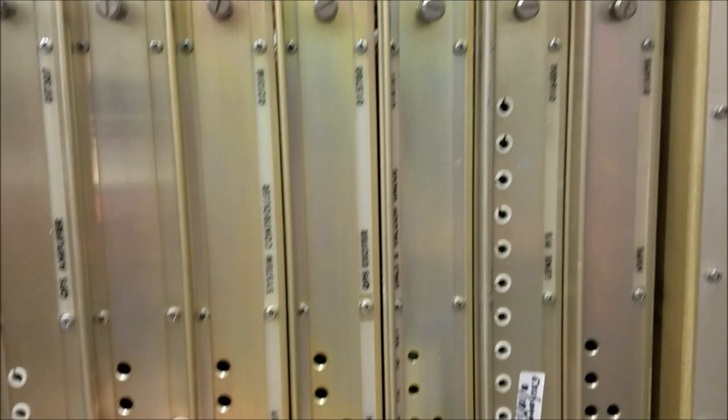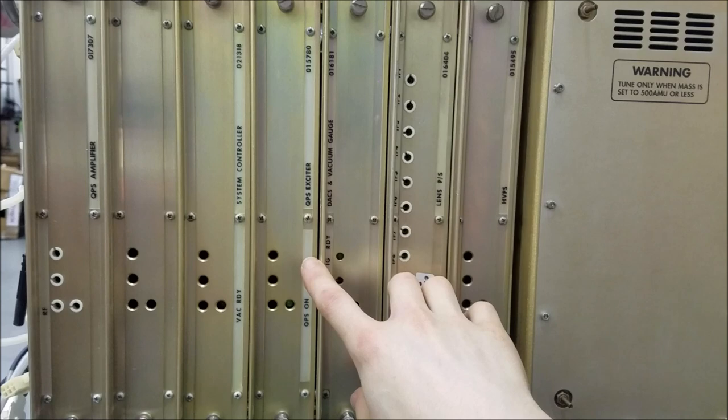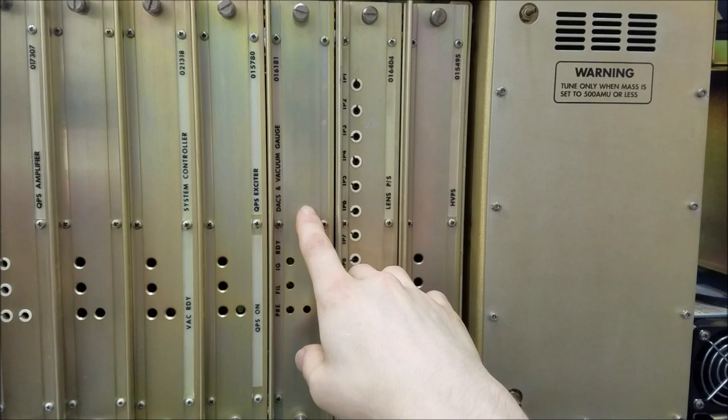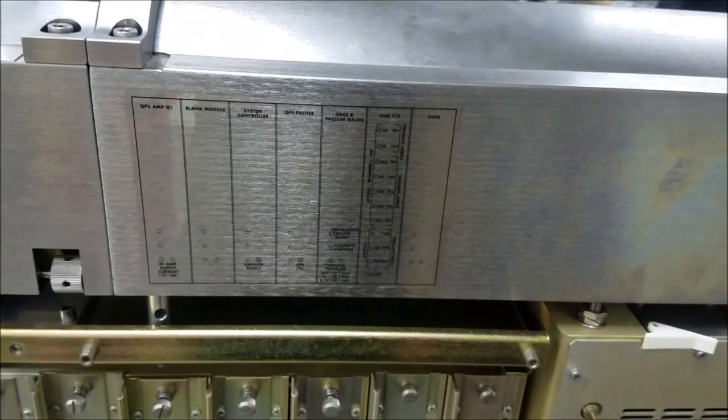We have a couple of different cards here. This one is a blank module — lots of excitement there. This one is the system controller, so probably the brain. This one is probably for generating some of the RF. We've got DAX here — digital analog controllers — and then for measuring how much atmosphere is inside the test module. A whole bunch of test points on here. Let's see what this one is — it says 'Lens.'